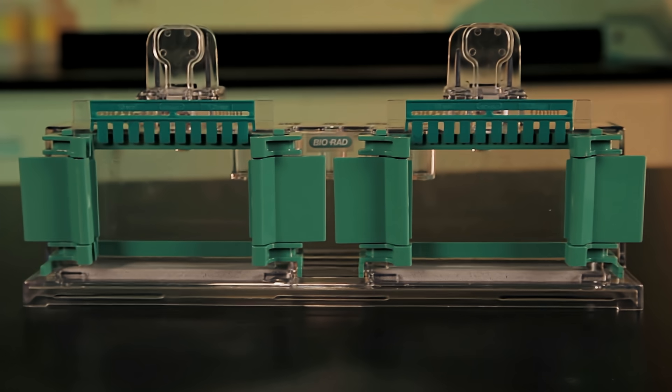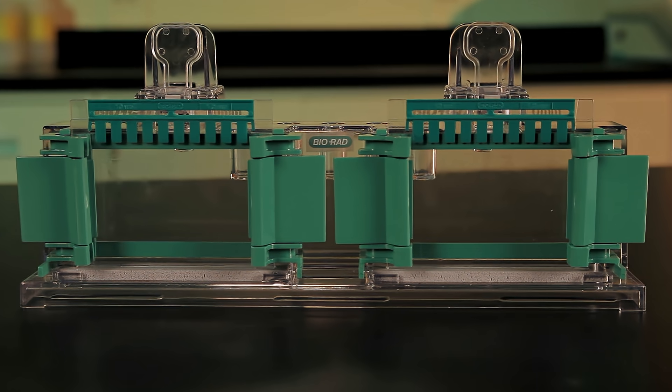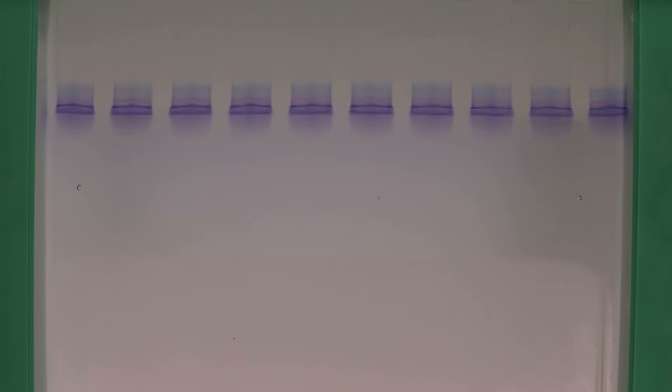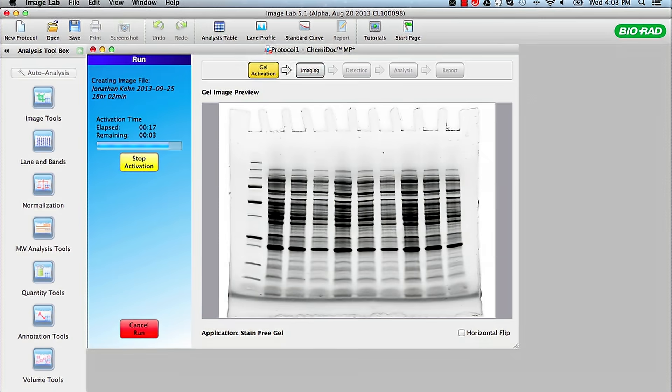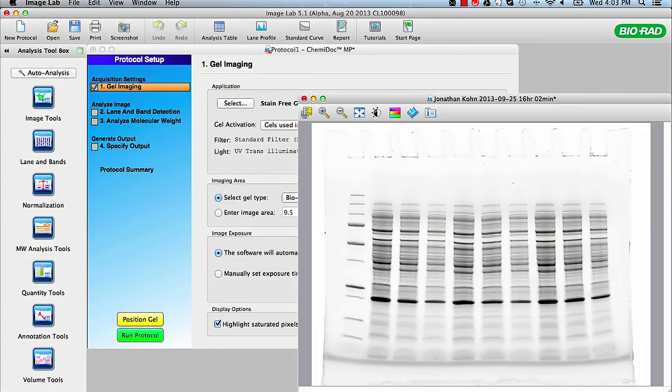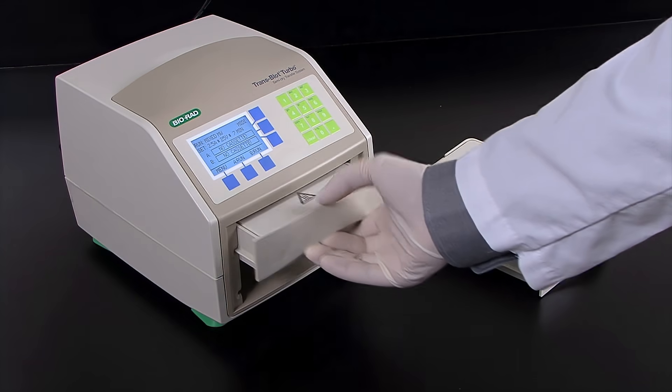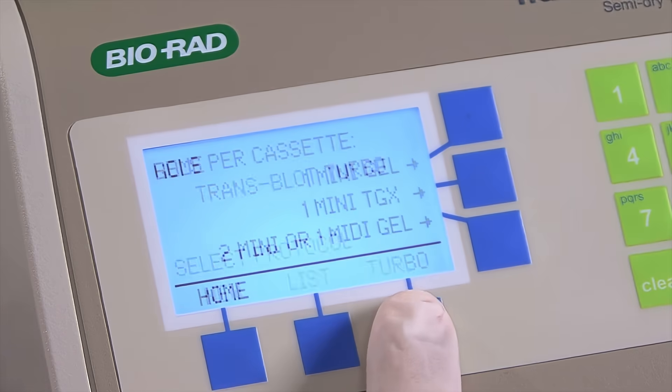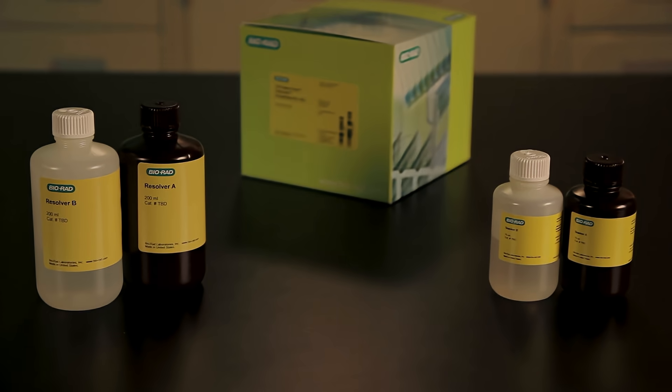You are now ready to run your Bio-Rad TGX FastCast gels. FastCast gels can be run in as little as 20 minutes and can be visualized in less than 5 minutes without staining using stain-free technology, and can be transferred in 3-7 minutes using the TransBlot Turbo. FastCast kits provide unparalleled convenience and performance.